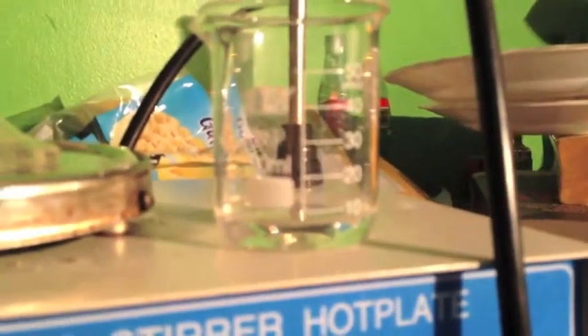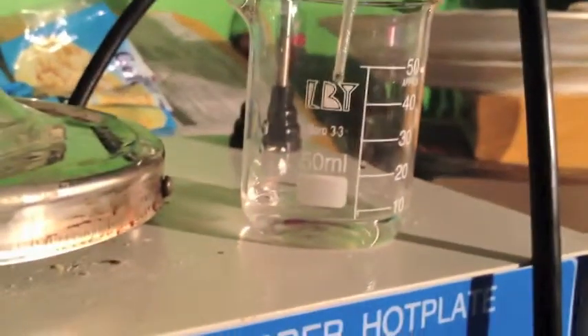What I'm doing here today is titrating this sample of hydrochloric acid with this sample of one molar sodium hydroxide to determine the concentration of the acid I made using NerdRage's method.